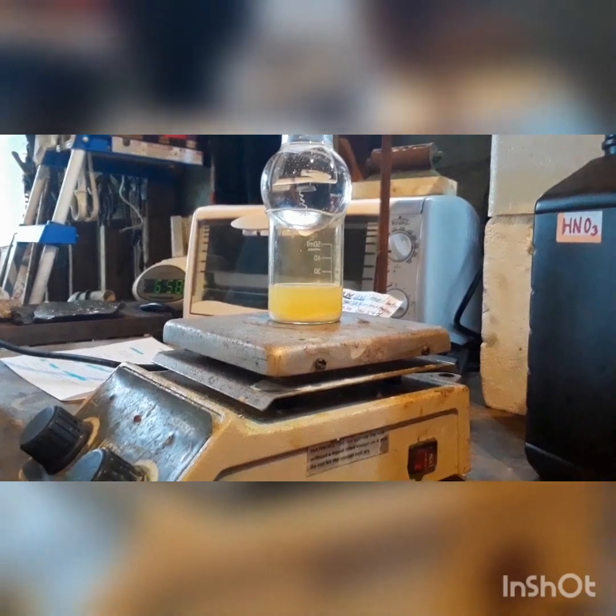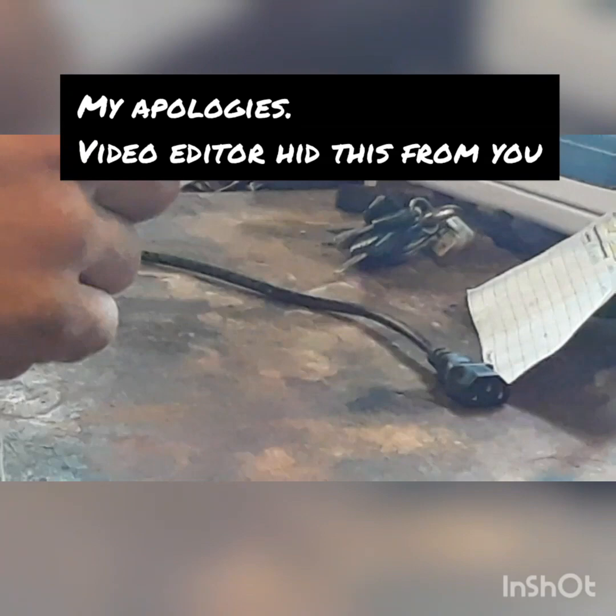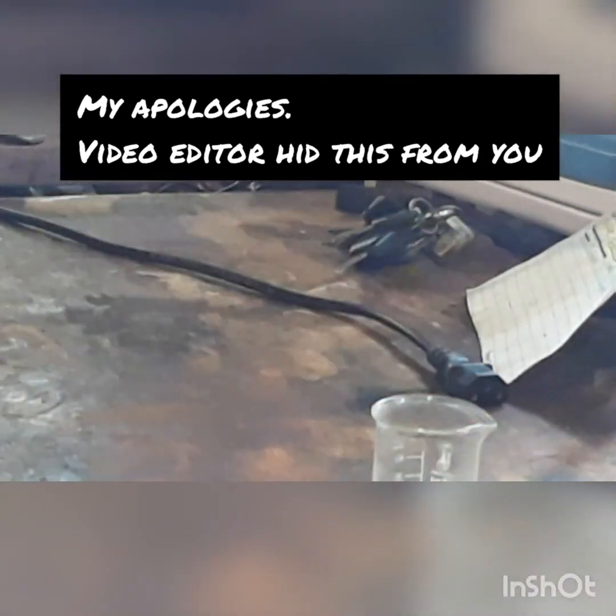We are just going to wait now for our acid to cool down and for the rest of the small nano particulates and so forth to fall out of suspension, and then we will filter our solution. Our nitric acid solution with our lead nitrate in it has been cooling. To expedite the process I actually put mine in the fridge — that is why you can see this little bit of condensation on there. Now you should be able to see there are two distinct layers: your layer of nitric acid up here, and all this white powder down here — that is our target product, that is our lead nitrate. So the next thing we need to do is set up for vacuum filtration and filter off this product.